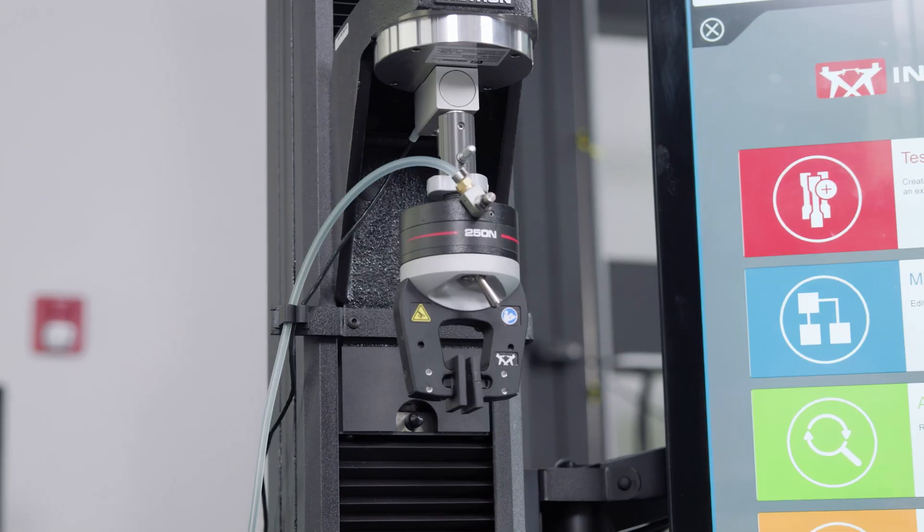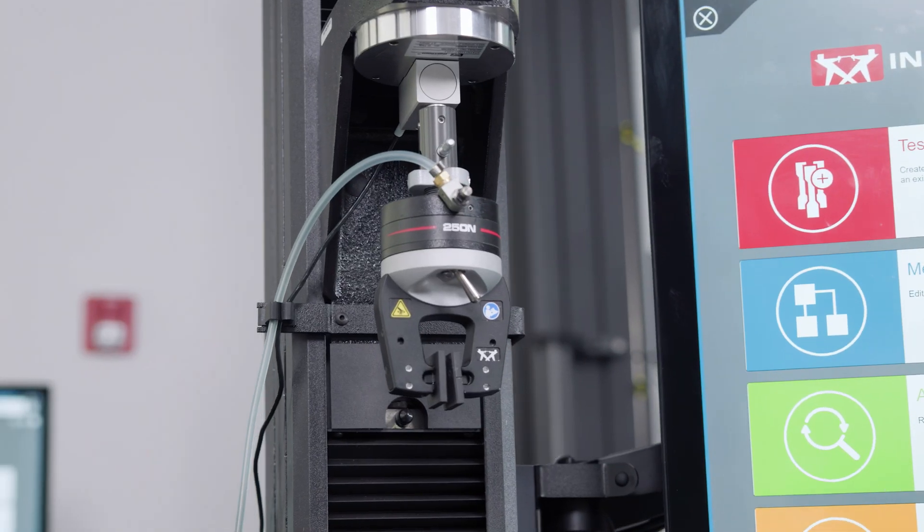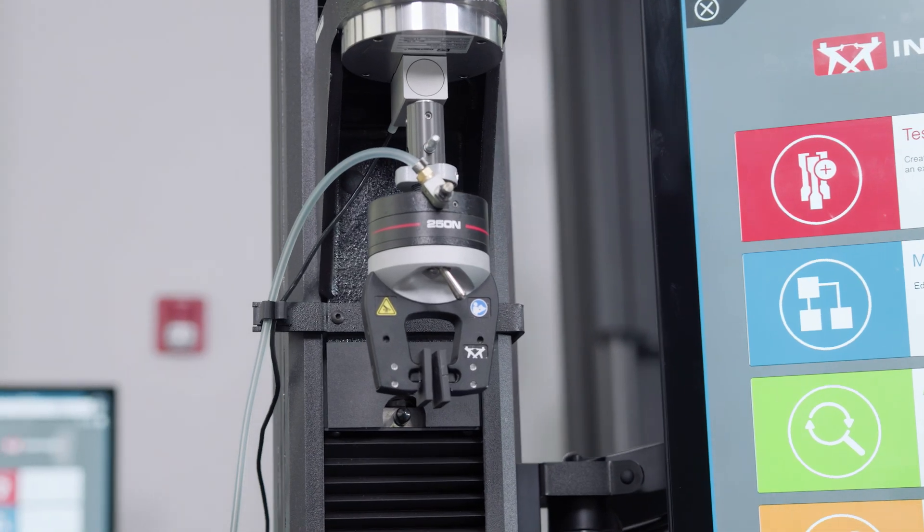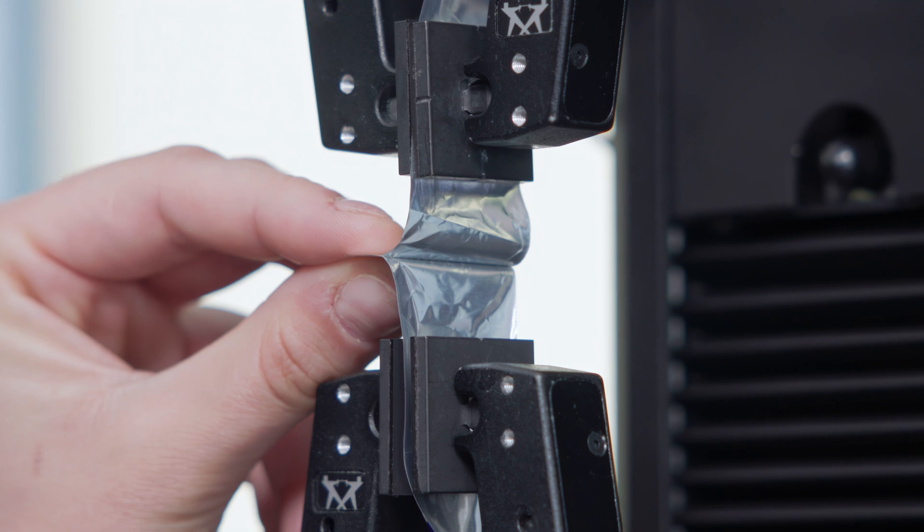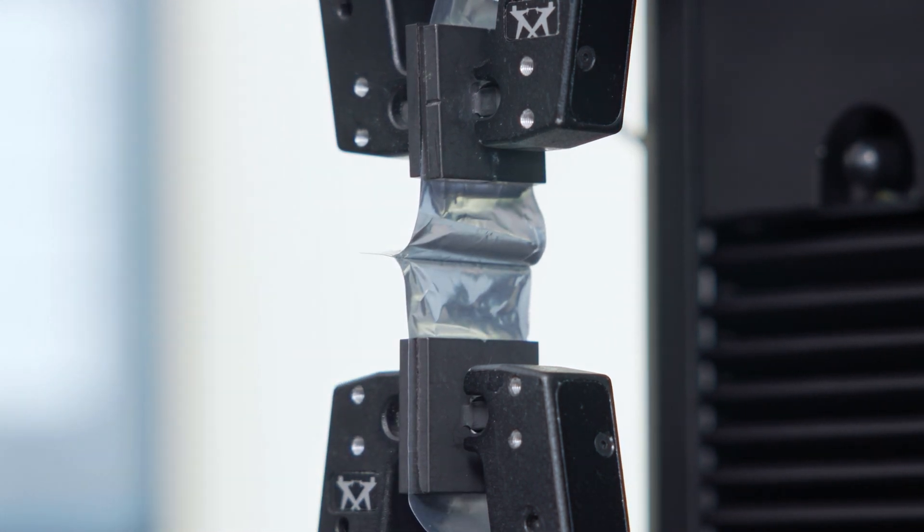Pneumatic grips are preferred for this application because they produce more repeatable results and increased throughput.